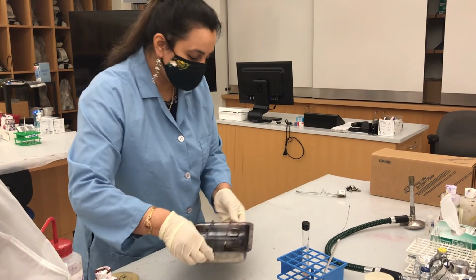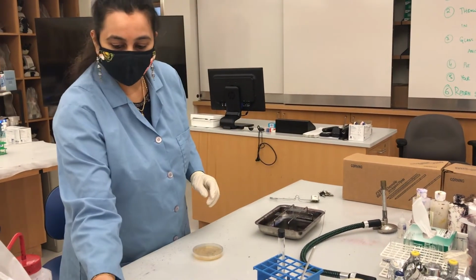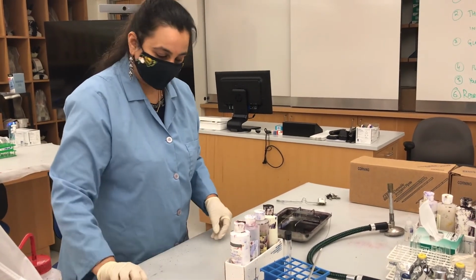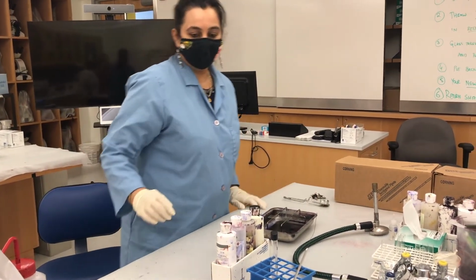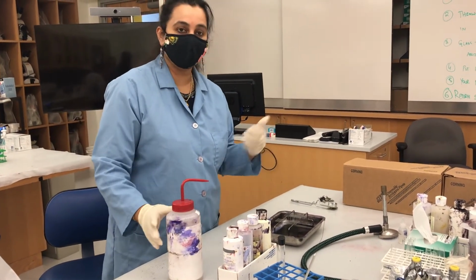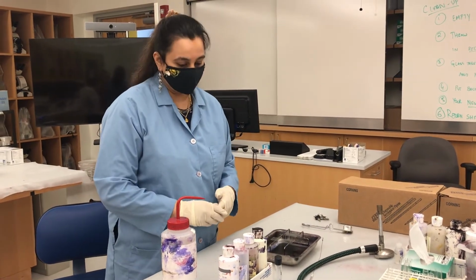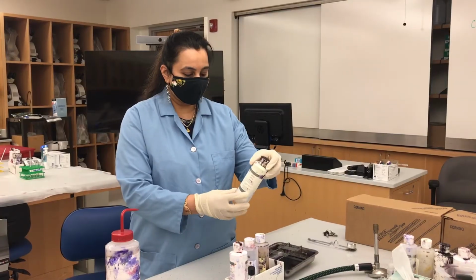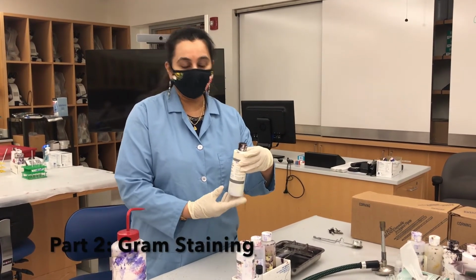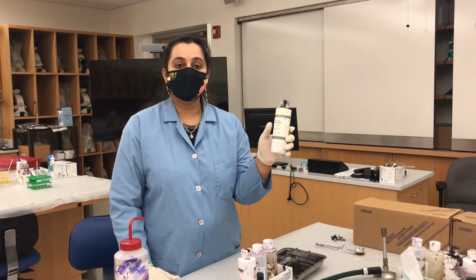For the gram staining technique, you need the gram staining reagents, which are right here. Distilled water, because you'll be washing the stains. And you also need a timer. Procedure, it's very important to make sure you have all the reagents in the specific order. The first step would be to add the primary stain, which is going to be crystal violet.